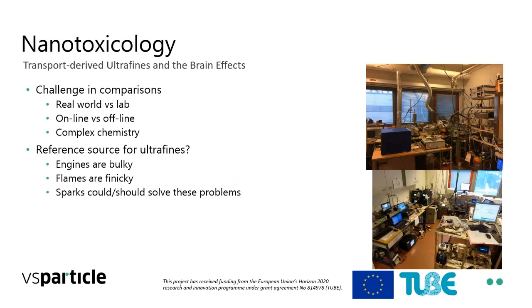But so far, some things I could talk about is that you need a whole bunch of infrastructure to do these measurements, right? And it gets very challenging because we're trying to compare real-world situations versus the lab, and they are very different. A whole bunch of the techniques are online. A lot of aerosol instrumentation gives you immediate results, but a lot of the biological assays tend to take more time. So these are offline. How do you compare those things, especially having an unstable aerosol? And of course, the chemistry is rather complex as well.